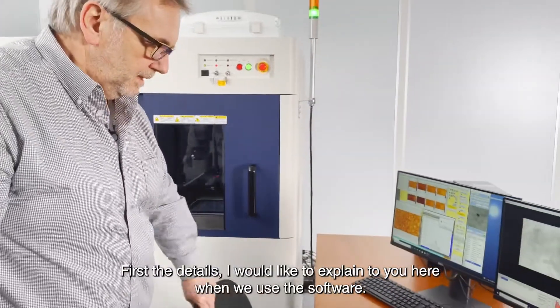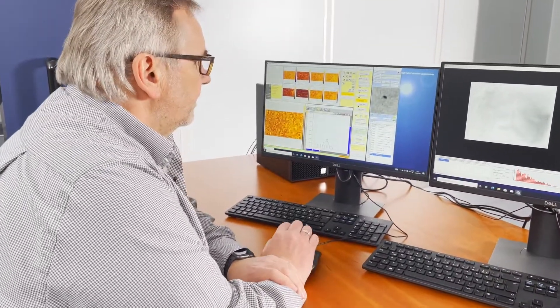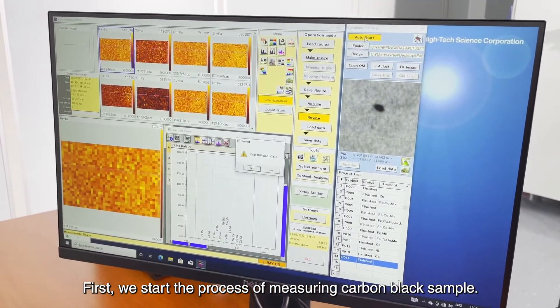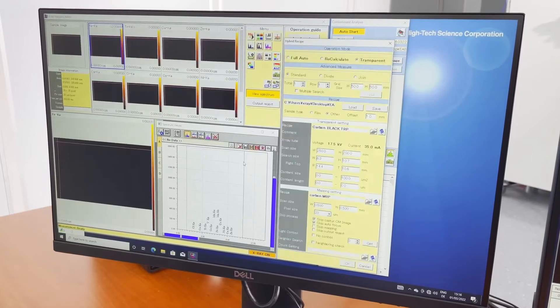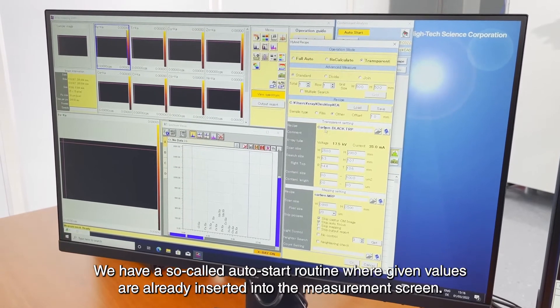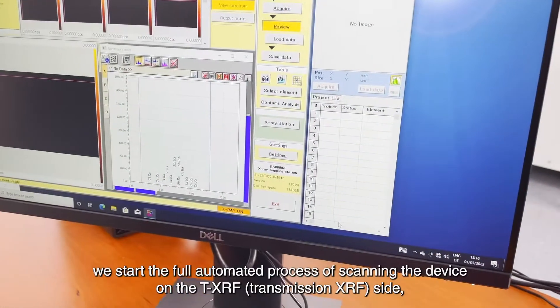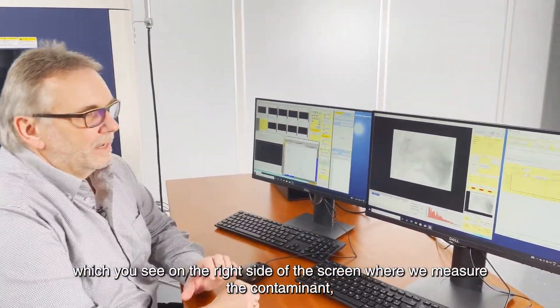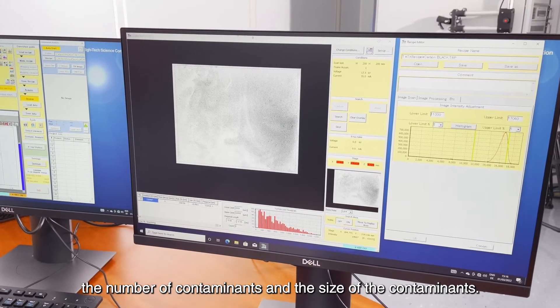Further details I would like to explain you here when we use the software. First we start the process of measuring a carbon black sample. We have a so-called auto start routine where given values are already inserted into the measurement screen. And by simply clicking OK here we start the full automated process of scanning the device on the TXRF side which you see in the right side of the screen where we measure the contaminant number of contaminants and the size of the contaminants.